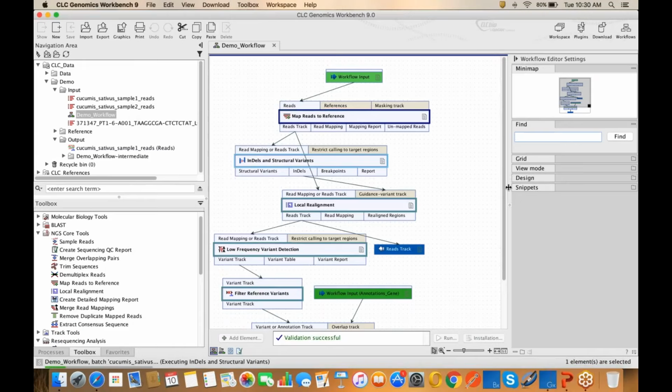And another good feature is if you keep the workflow open, you can also see which steps in the workflow it completed and which steps in the workflow it's executing. So the dark purple box means the step is done. The lighter box means it's still going.